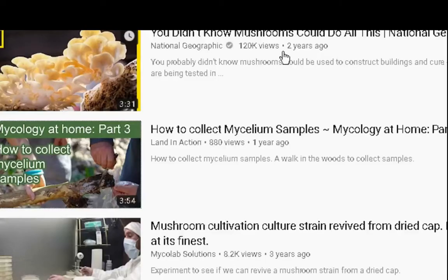And what was the other? Oh yeah. Erlenmeyer flask, boil method on hot plate. I'm thinking I want to go that route because I don't have a pressure cooker. That's sort of my problem there.